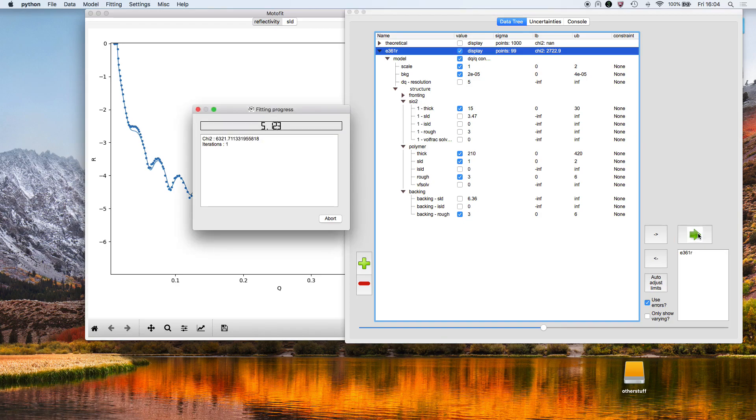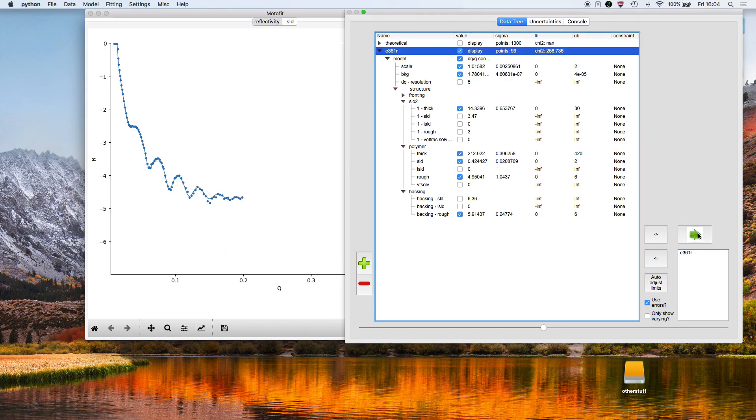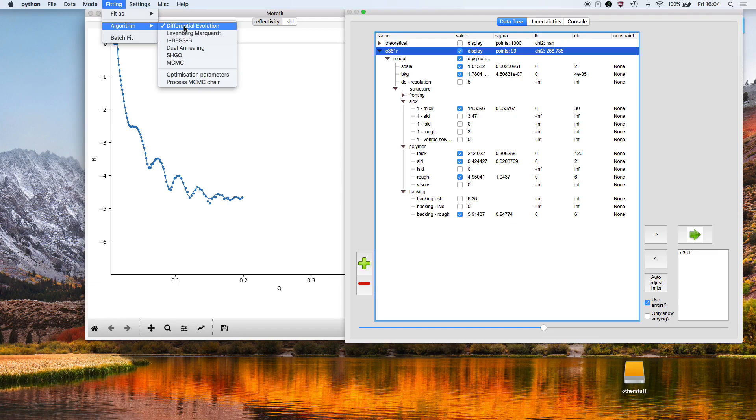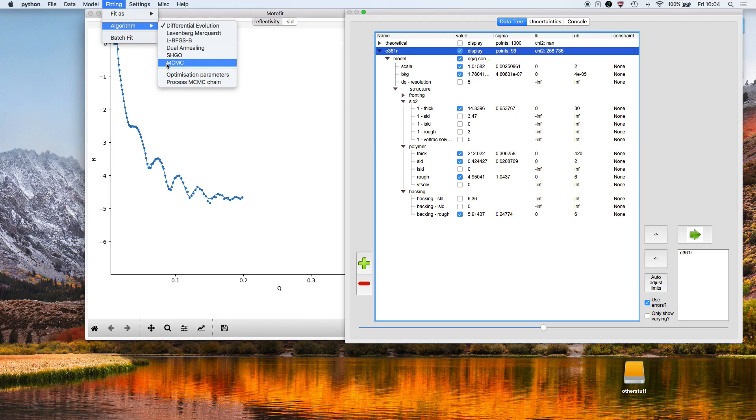Now it's doing the fit. Fit is finished. By default, it uses differential evolution for the fit, but you can use a wide range of minimizers or use Markov chain Monte Carlo if you want to estimate the parameter uncertainties accurately.